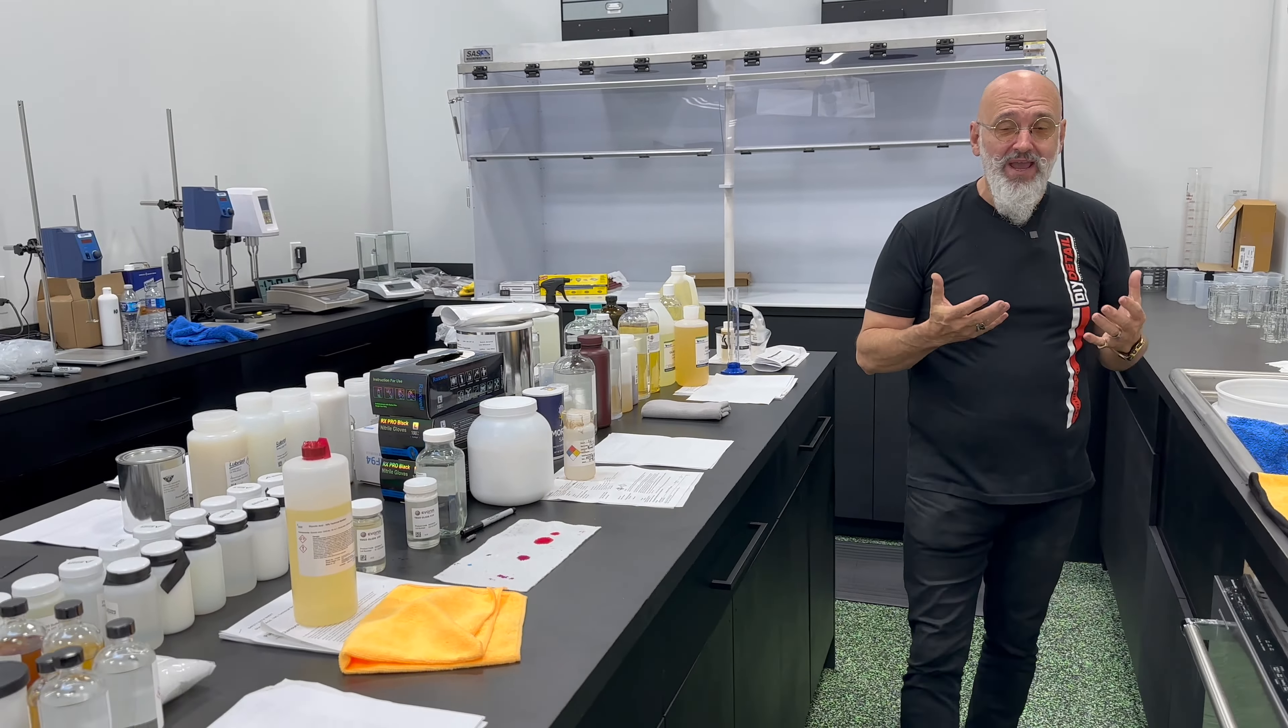This contraption, and it looks something almost homemade, but it isn't. This is for ASTM testing of fabrics. And water goes in here, your fabric is stretched here with basically a paper towel underneath. And the paper towel, you measure it before, the weight of it, and you measure after.